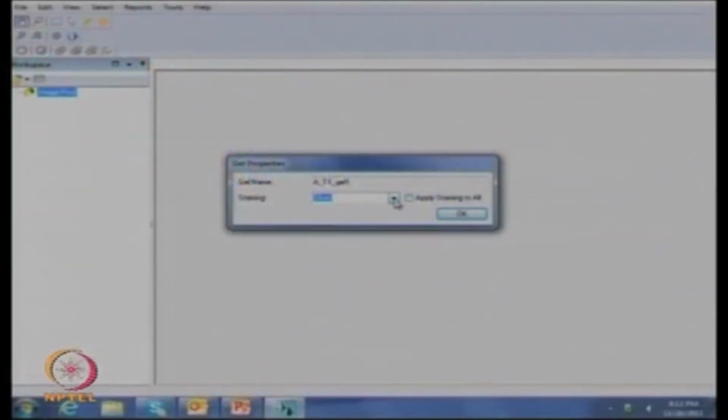Now, as we discussed in our PPTs, this is the thing which is asking for particular staining. Here we can give Coomassie or silver or different fluorescent. As this is stained with silver, I am giving silver and I am applying the same color for the remaining gels. Now click on OK. Now as you can see the 6 gels at a time in this overview.